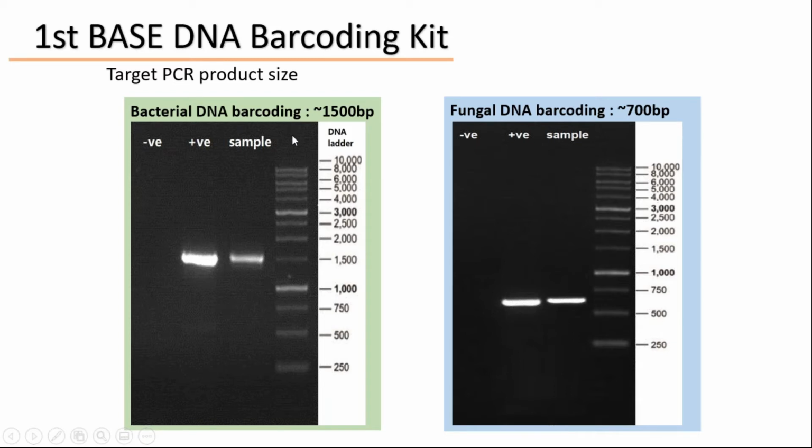Okay, and for the fungal DNA barcoding, the expected size of the target is around 700 base pair.